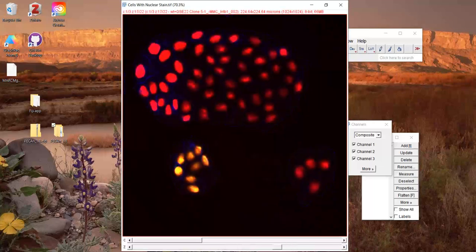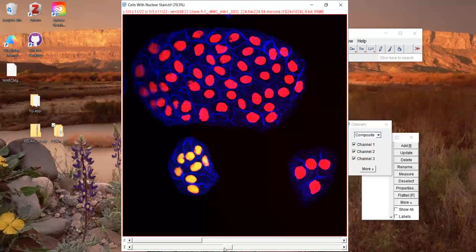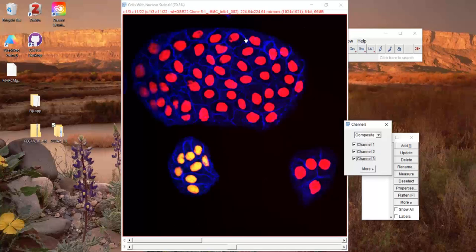As you can tell, this is a pretty different image from the ones we've done in the past. We've got 3 channels. One is just a nuclear stain with DAPI. Then we mark the genotype of these cells using a nuclear GFP. And then we have a staining that seems to cover the entirety of the cytosol and mark out the membranes as well. So we have to come up with a strategy here.